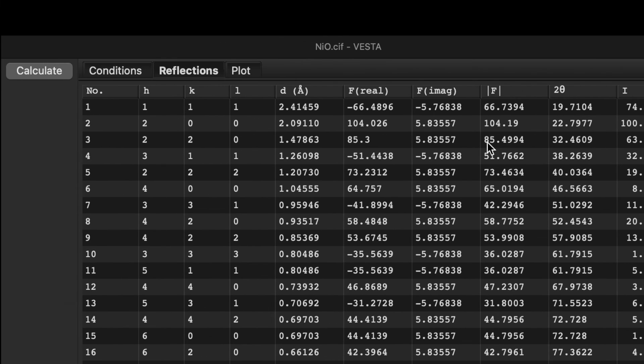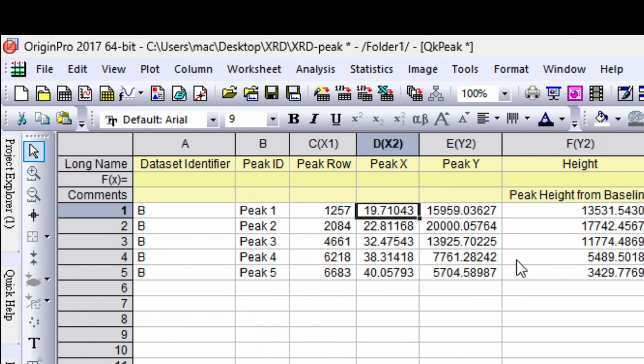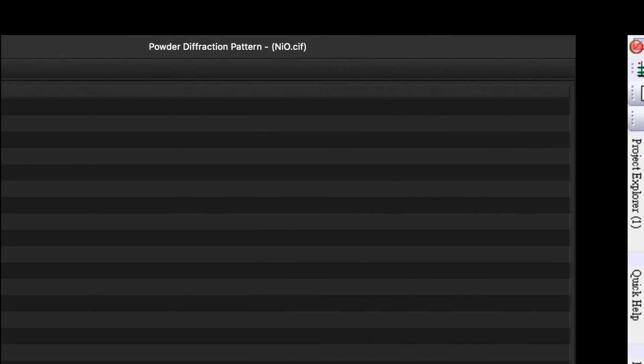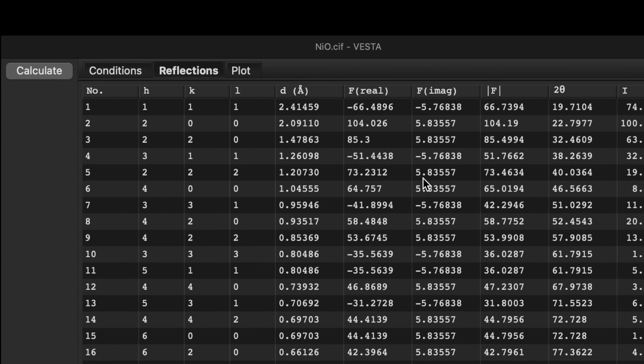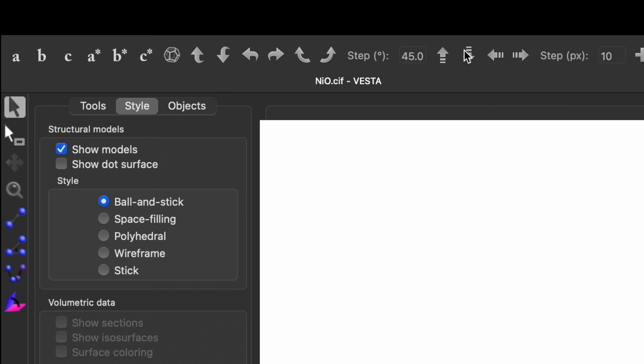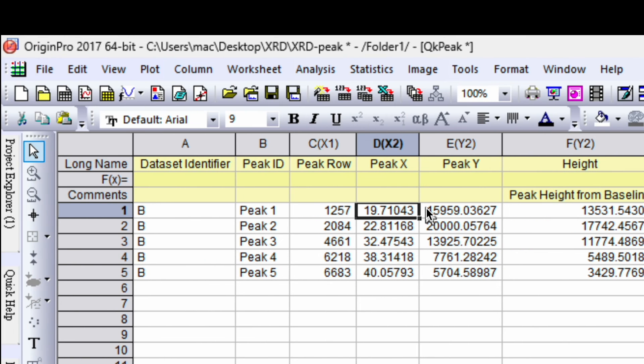So although these numbers are not exactly matching with the numbers what we have from the peak, so for that what you need to do is you need to tune your lattice constant again and again so that it will perfectly match with your peak center. You go to the edit, edit data and the unit cell.